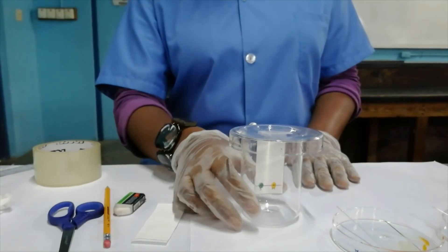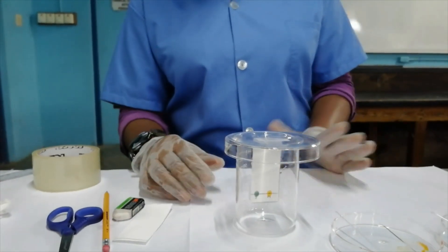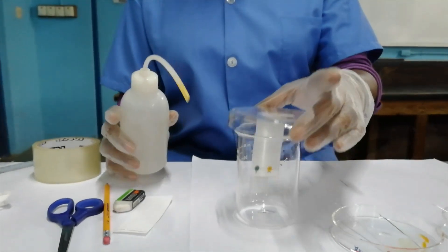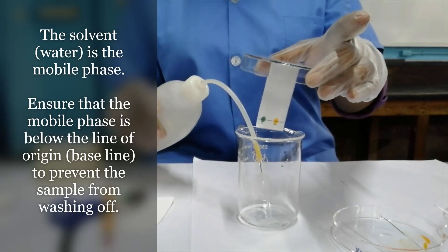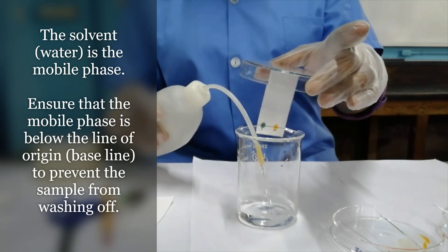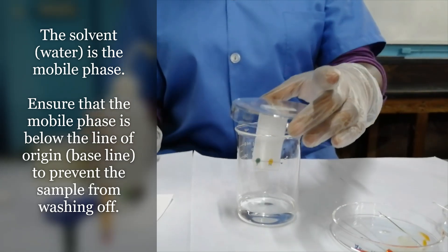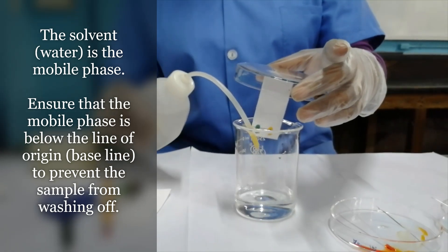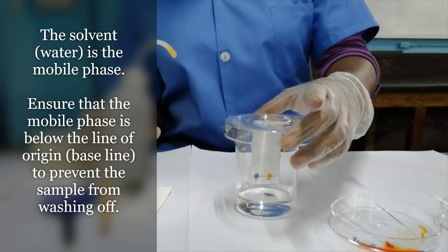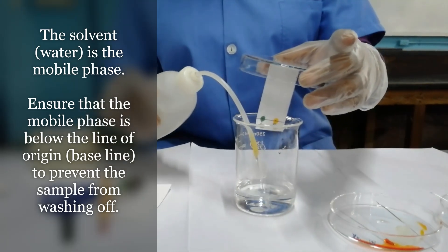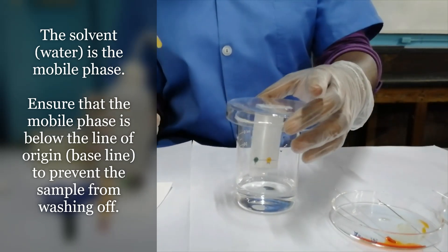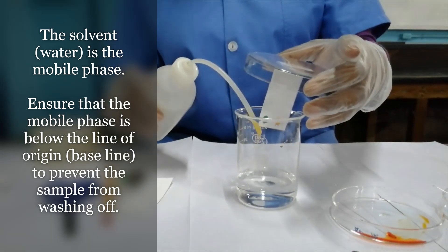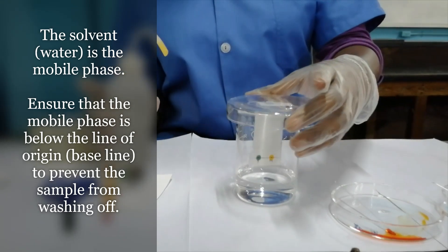What I'll do now is add water, which is my solvent or mobile phase, until the water just touches the tip of the paper. I do not want it to pass the tip because the spots will run down into the reservoir instead of traveling up the paper. I want the spots traveling up the paper, not running down.